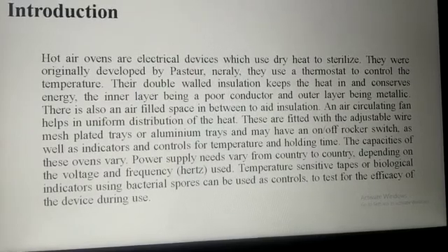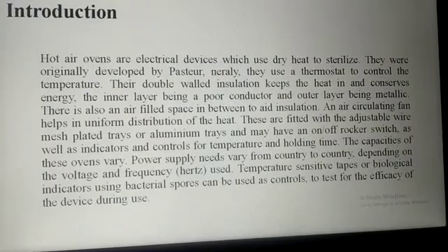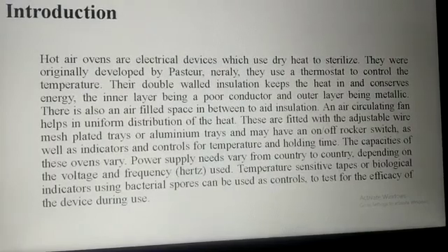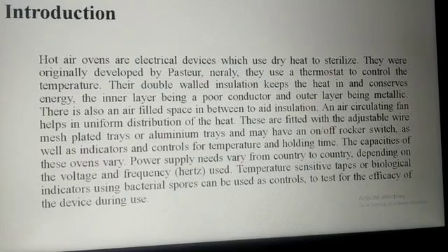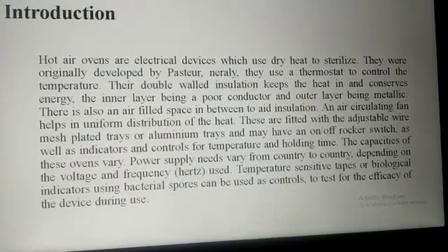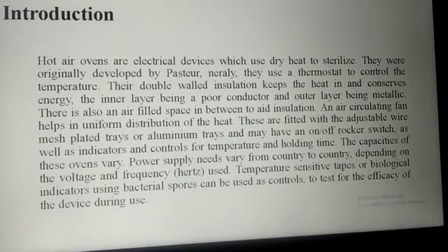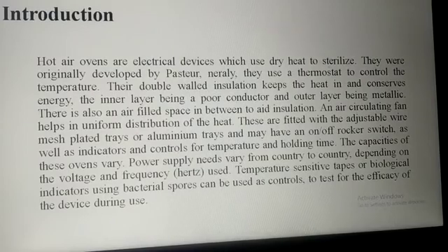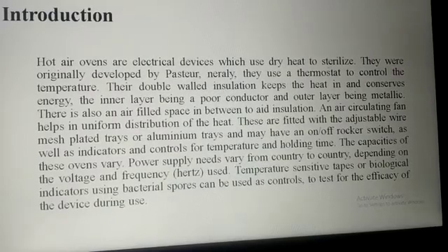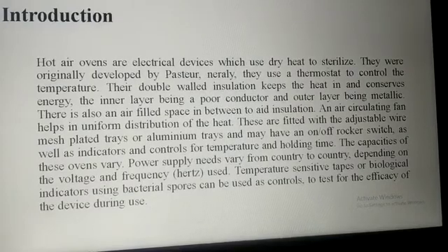They use a thermostat to control the temperature. Their double-walled insulation keeps the heat in and conserves energy, the inner layer being a poor conductor and the outer layer being metallic. And there is also an air-filled space in between the two insulation layers.